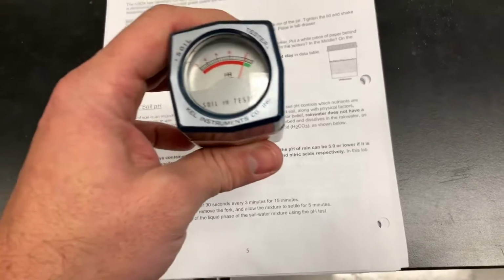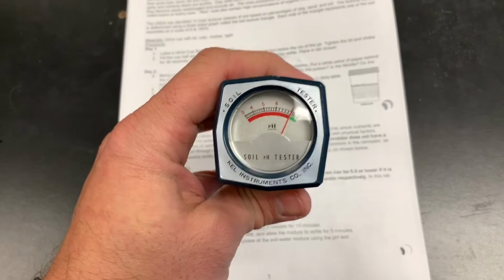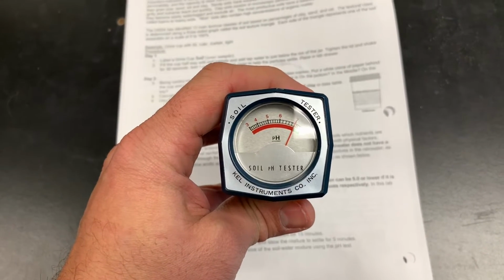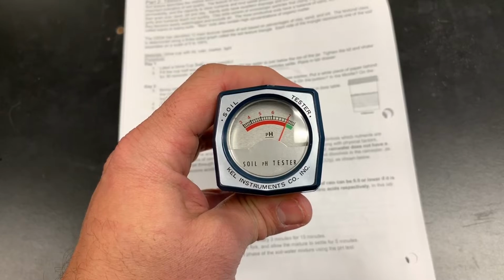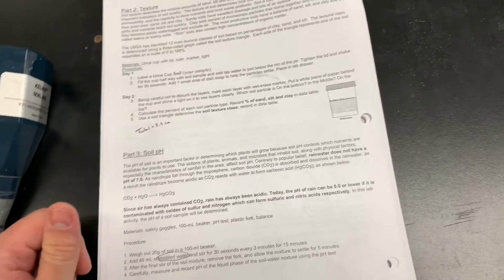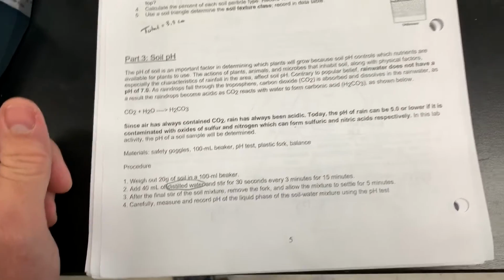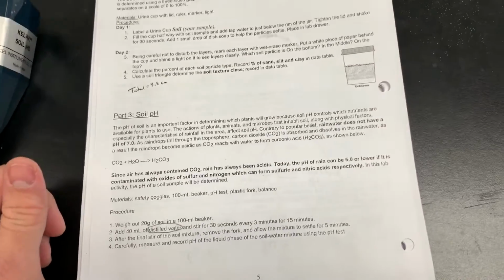They've got a point on them. Basically you stick it in the soil and find a good spot where it stays steady. It'll move back and forth, and you basically just jot down the pH. It's pretty easy, and it gives you the directions in here on how to do that. And that's it. Write down the pH.